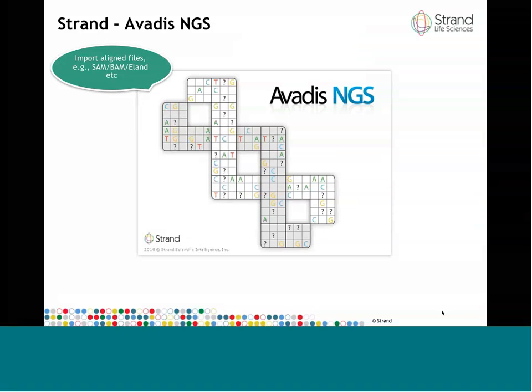What Avadis NGS does is that it allows you to import aligned files and then run workflows for ChIP-seq, RNA-Seq, and DNA-Seq. So the thing to note is that Avadis NGS starts from the output of alignment. If you have reads obtained from your sequencer, then you need to put them through an alignment pipeline.